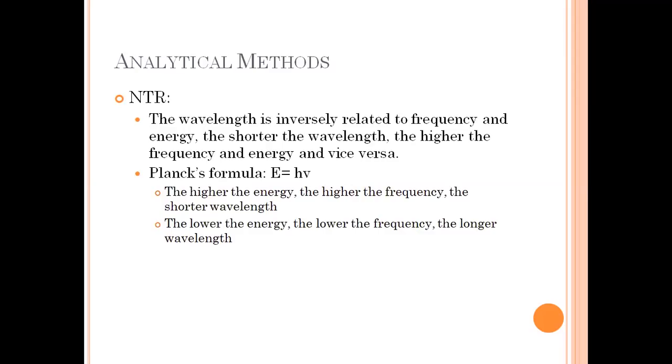By following that formula, we could say that the higher the energy, the higher the frequency, however, the shorter the wavelength, because the wavelength and the frequency have an inversely proportional relationship. And the lower the energy, the lower the frequency, however, the longer the wavelength. So when your energy is high, the frequency is also high. So energy and frequency have a direct proportional relationship.